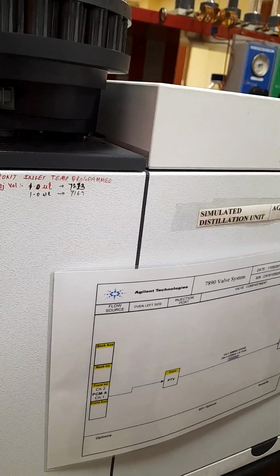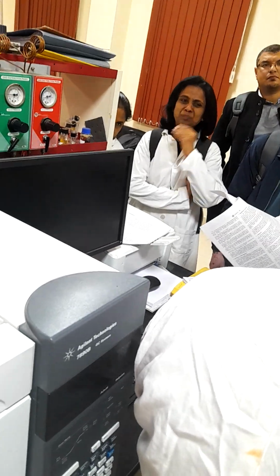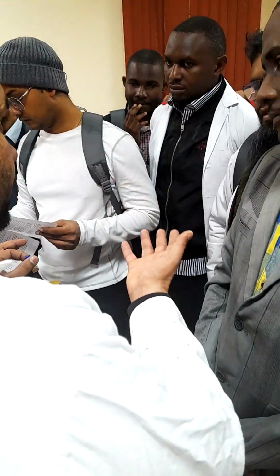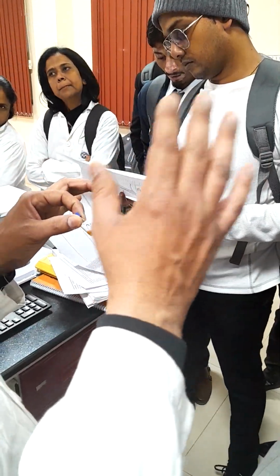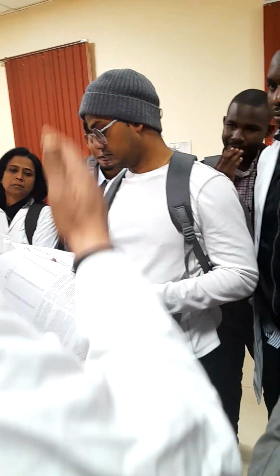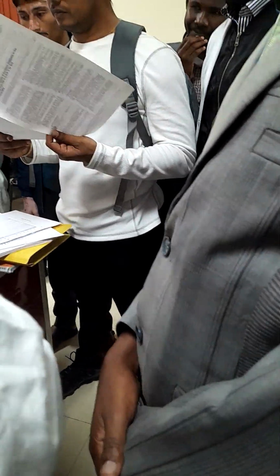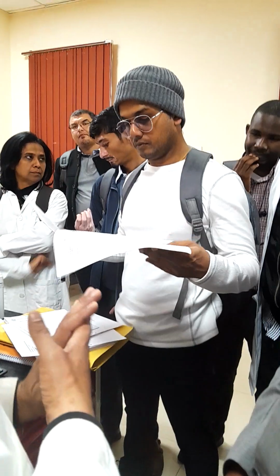Our user then told us that it is a pyrolysis oil sample, and his or her aim is to get a pyrolysis sample within the range of diesel, or its final application is to get diesel with this pyrolysis application. So this sample must lie within this range. I will run this sample and it will give the data according to the calibration mixture, showing which type of hydrocarbons are converted. With this RT correlation, I will get the data for this specific sample: whether C5 is there, C8 is there or not, C20 is there or not. That data we can get according to boiling point.